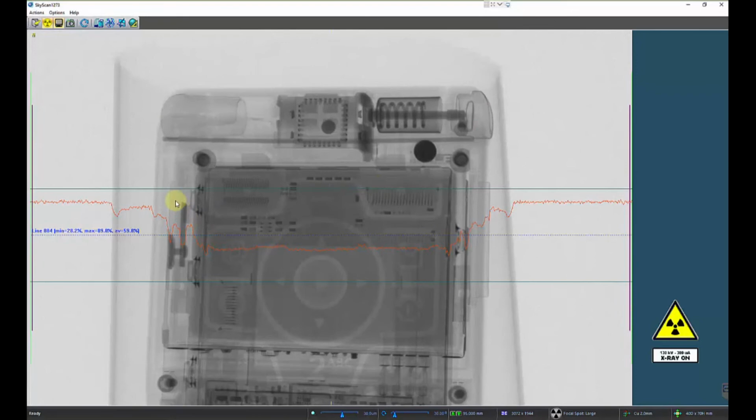All right, so we're going to be focusing on the central region here of the sample. While we've already set the pixel size earlier based on the needs of the project and positioning our sample, we want to talk about a couple considerations. One, it's always a good idea to leave some air on the left and right side of your images when you're setting up a scan. That'll help your reconstruction stay nice and linear and help you get really good density data out of your samples if that's what you're going for.